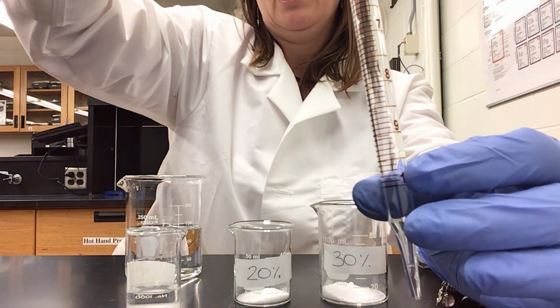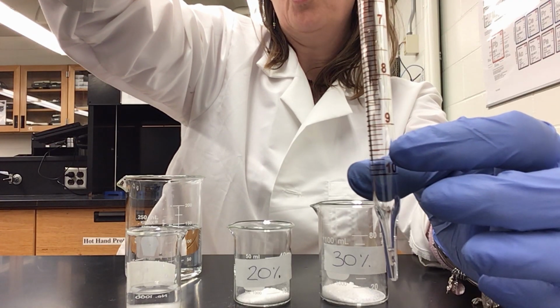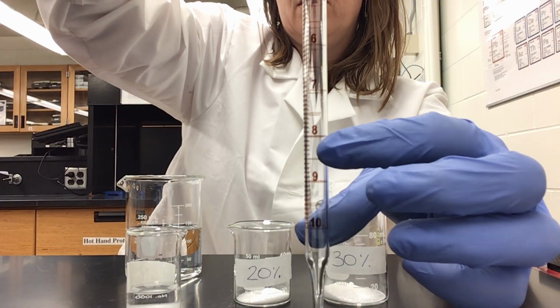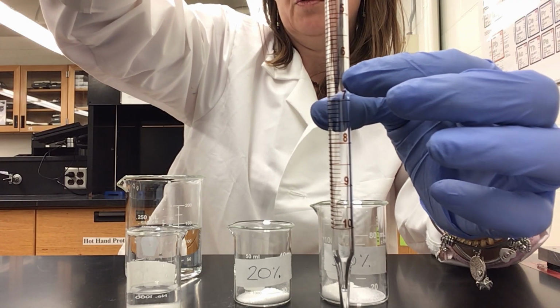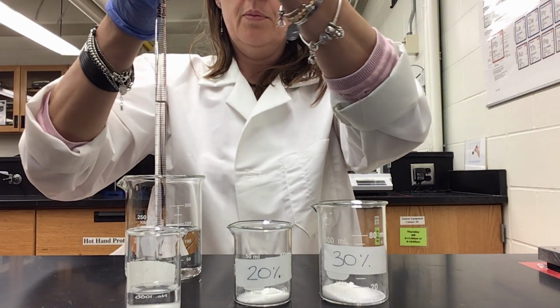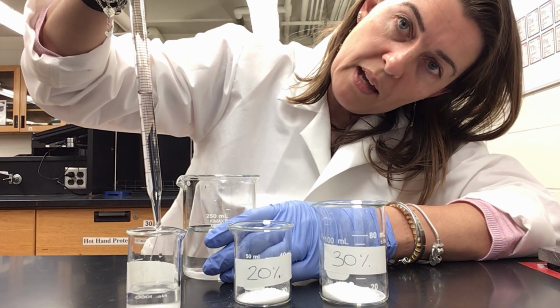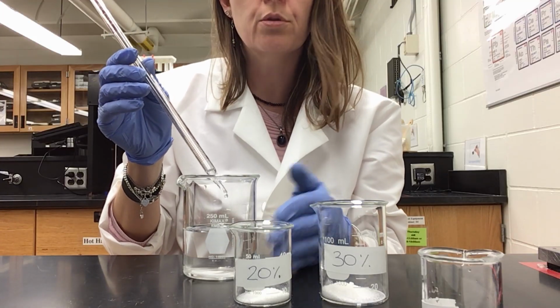See, this is graduated, and each small line corresponds to 0.1. I need to arrive here, which is the 0.5, right in the middle between the two integers. So now I need 3.5: 1, 2, 3 milliliters, 0.5, and a tiny bit more to account for the 3.52. Okay, so I go higher, I take down the bulb, I use my thumb, and I go to the mark that I determine to be the one I need. There we go. Okay, so now again, drop up to the 10 mark. There we go. Now I am gonna do the same thing for the 20% solution and the 30% solution.